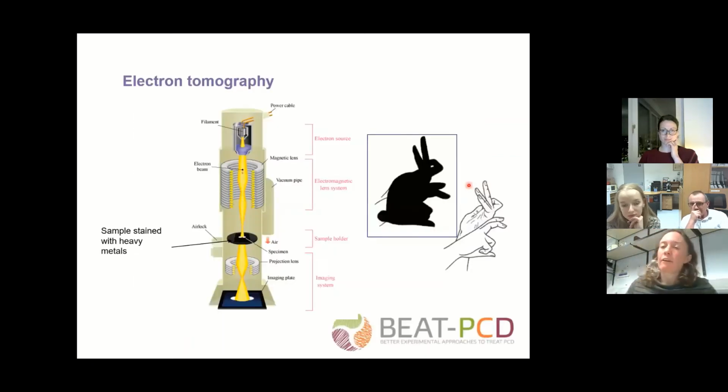I'm going to go off on a bit of a tangent now and talk about electron tomography, and I'm going to do that because these defects are some of the first that were seen properly by electron tomography. So sometimes with those central complex defects, there is an awful lot of normal cross sections within them, and I used to think, well, it's a genetic defect, so why on earth are they not all abnormal if the gene's not there? And the answer to that really is that what we're seeing is the same as with an inner and outer dynein arm defect, we're seeing lack of inner and outer arms due to problems with assembly genes. With central complex defects, we're seeing a problem with the central pair disappearing as a consequence of problems with the radial spoke head proteins. And interestingly, you can see the primary defect by electron microscopy. You just need a better technique and a better microscope.